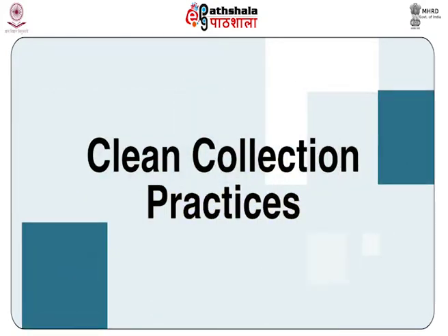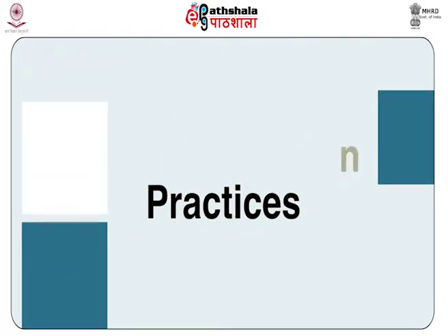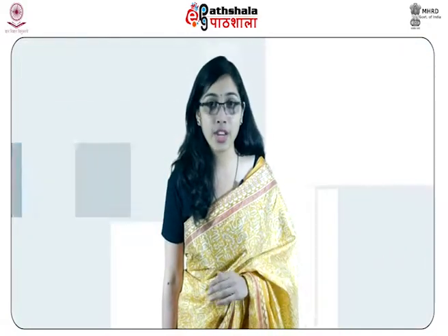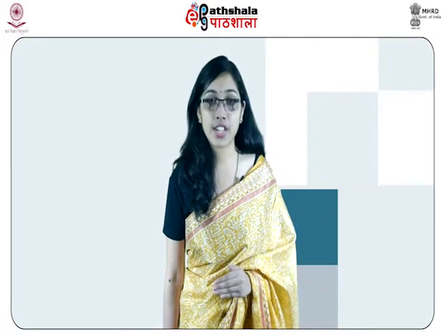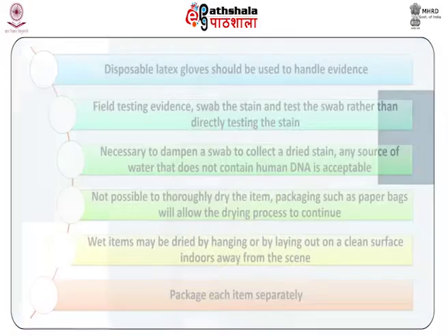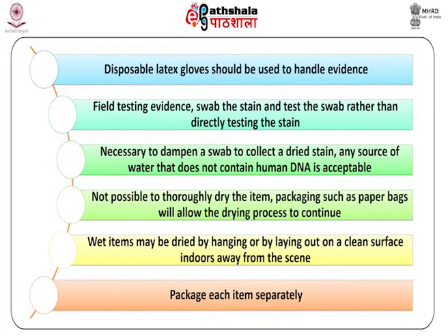Next, about the clean collection practices. Some of the ways to prevent the contamination and degradation of the biological evidence are: disposable latex gloves should be used to handle the evidence. When field testing evidence, swab the stain and test the swab rather than directly testing the stain.